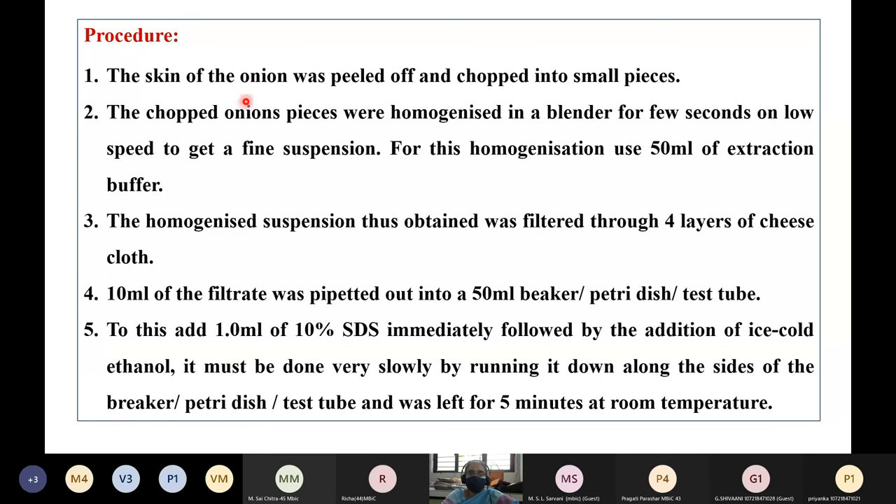The skin of the onion was peeled off and chopped into small pieces. The chopped onion pieces were homogenized in a blender for a few seconds at low speed to give a fine suspension, using 50 ml of the extraction buffer. The homogenized suspension was filtered through 4 layers of cheesecloth. 10 ml of the filtrate was dispensed into a beaker, petri dish, or test tube, and to this 1 ml of 10% SDS was immediately added, followed by the slow addition of ice cold ethanol along the sides of the vessel.